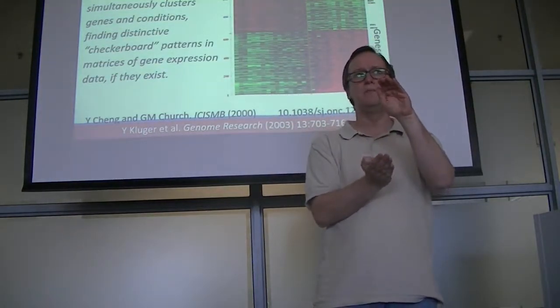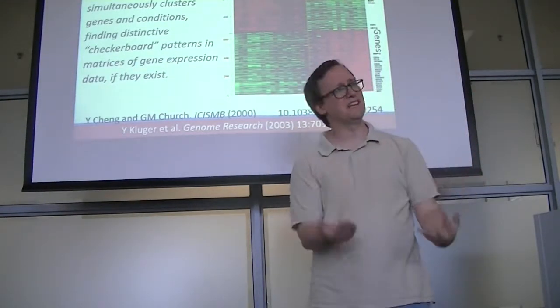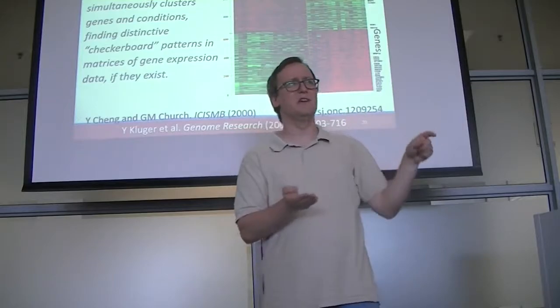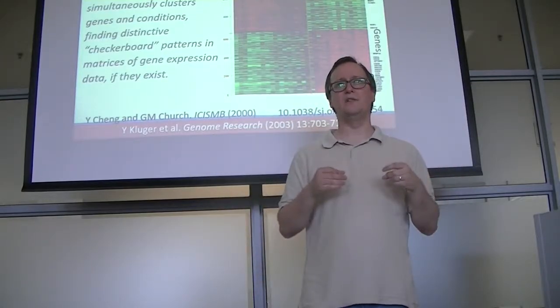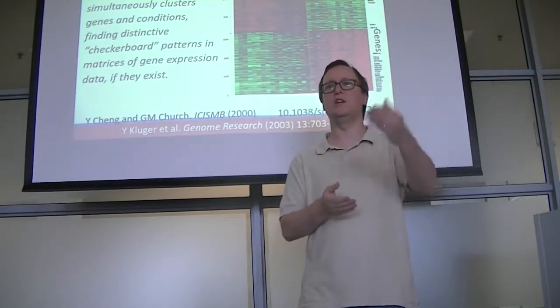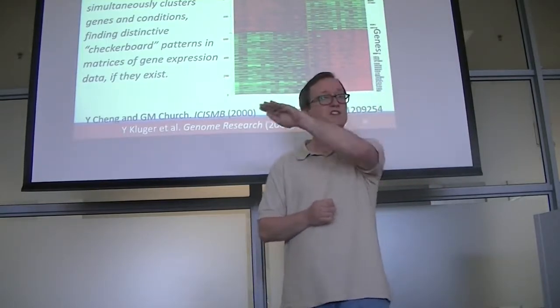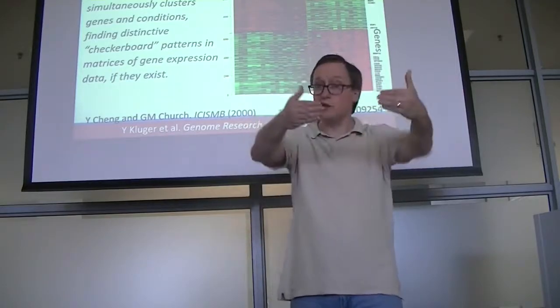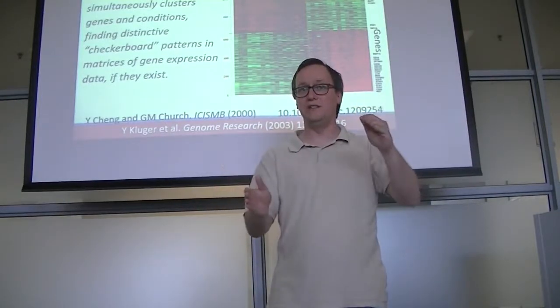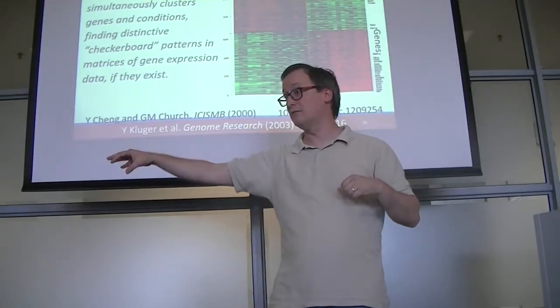Next, you would say, well, many of these genes show very little variance among all of the samples. Well, something like that's not going to be very informative. You're not going to find a difference for genes that have very little variance. So you might next say, I must have a coefficient of variation of at least 10% if I am to include this gene in further analysis. So now you're down to genes that were observed across all the samples and that had pretty good levels of intensity. And you can then ask which genes are most similar in their expression patterns across the cell lines.